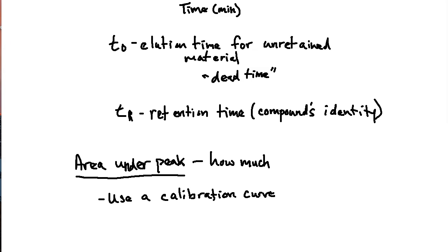So it can be a little bit of trial and error when you're first setting up your calibration curve if you don't know a whole lot about your samples. But once you have a reliable one, you'll know the area under the peak for the various concentrations of your lysine, and therefore you would be able to determine the amount based on any sort of unknown sample going through. And you always know that it's lysine based on the retention time. So that would just be an example there.